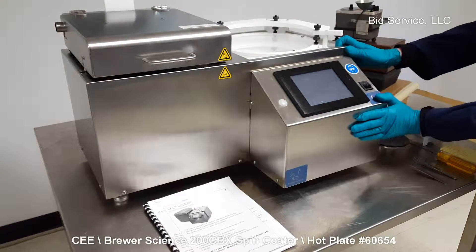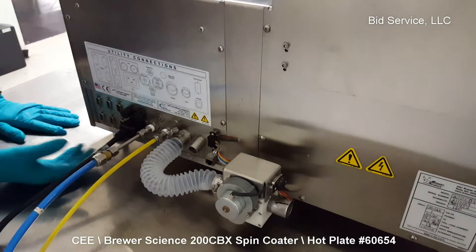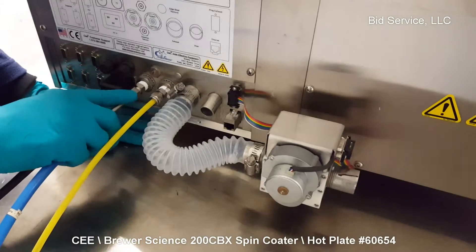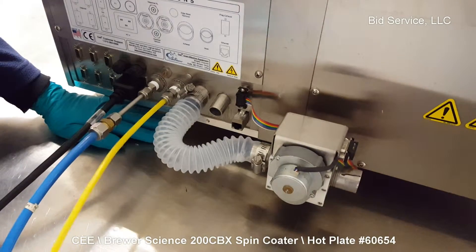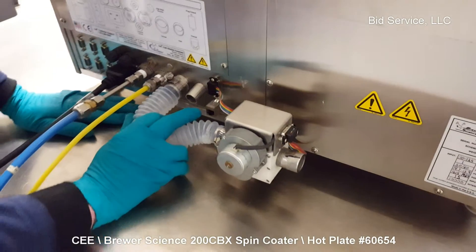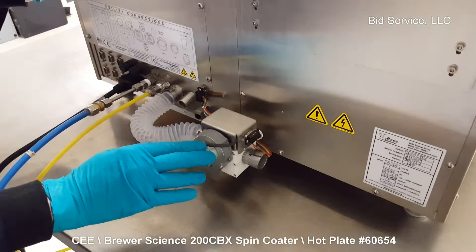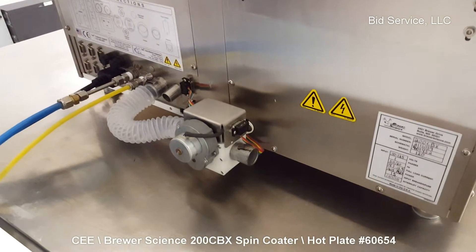Before we operate it, let's take a look at the connections on the back. Power is 120 volt, 15 amp supply, along with a nitrogen purge line at typically 70 psi pressure, and vacuum at 25 inches of mercury. There is also an exhaust, which is metered by the software, allowing you to open and close the damper as per your application. This is where you'd connect your hose for exhaust outside of the clean room.